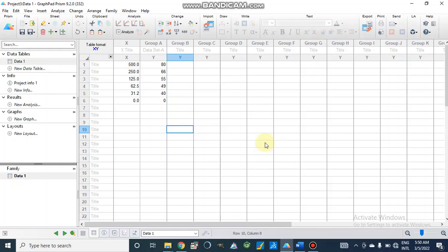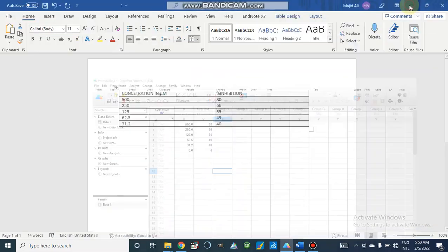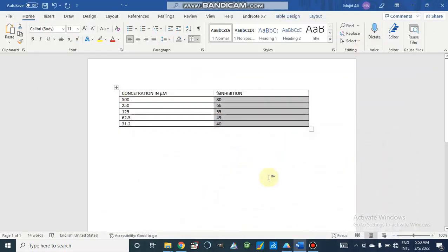Dear viewers, assalamualaikum. I am making this video on demand of my viewers and some students. In this video we will study how we can find IC50 values from different data.